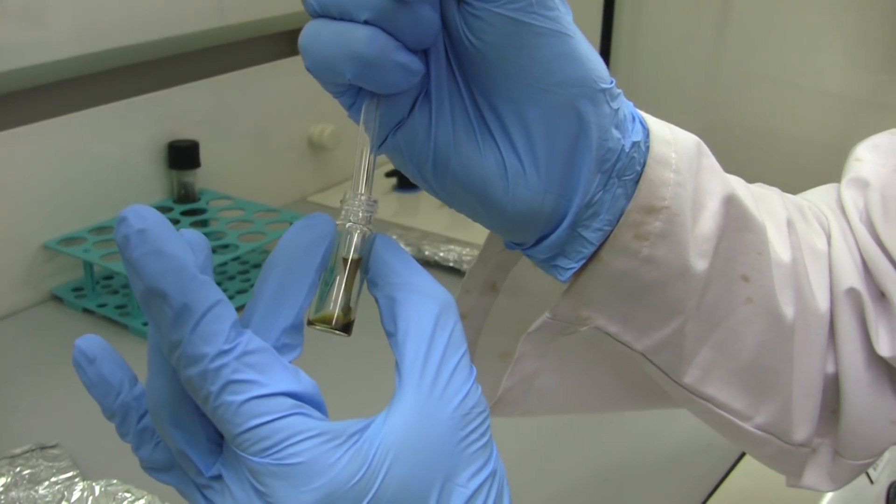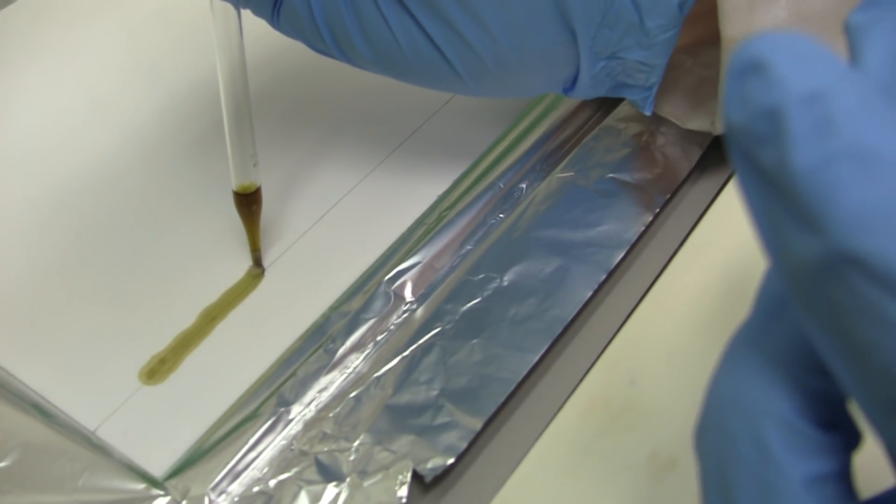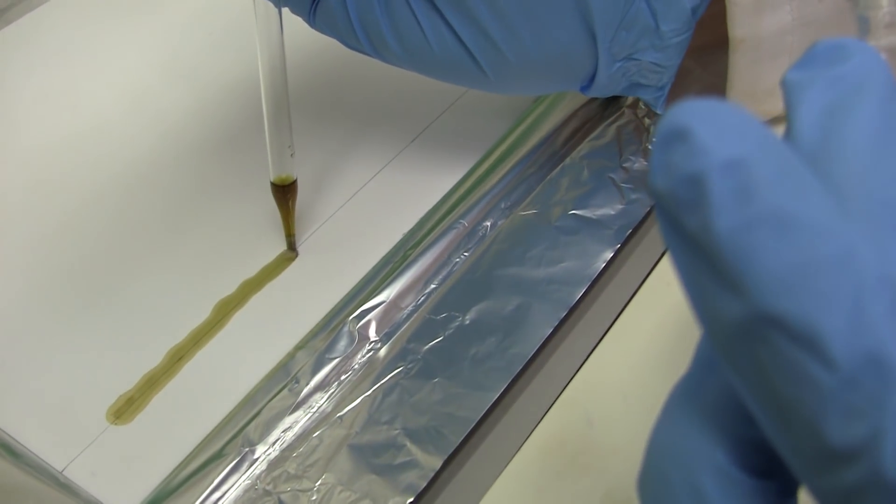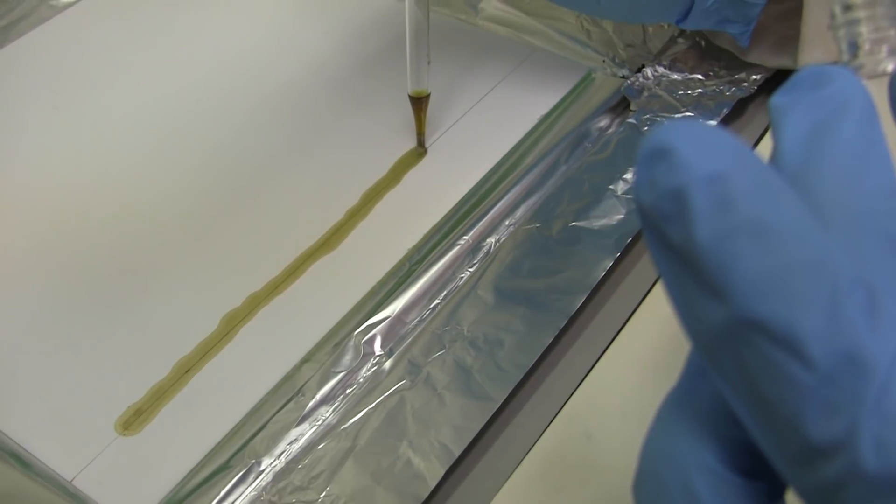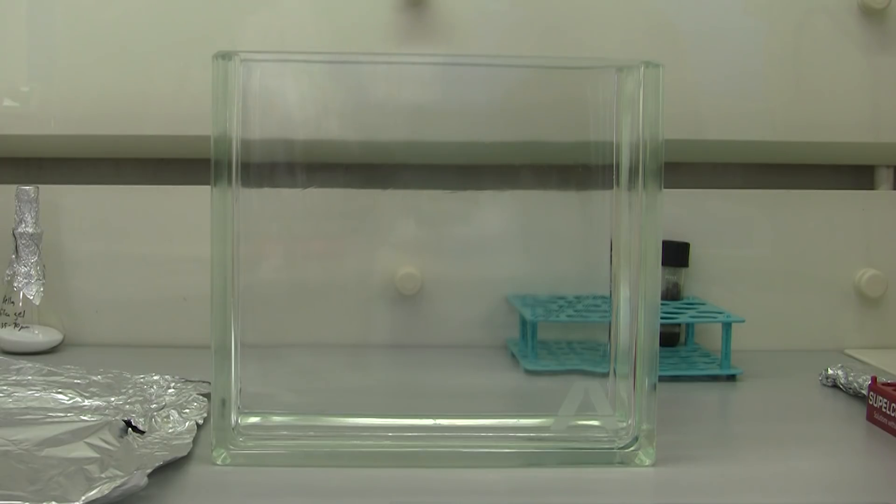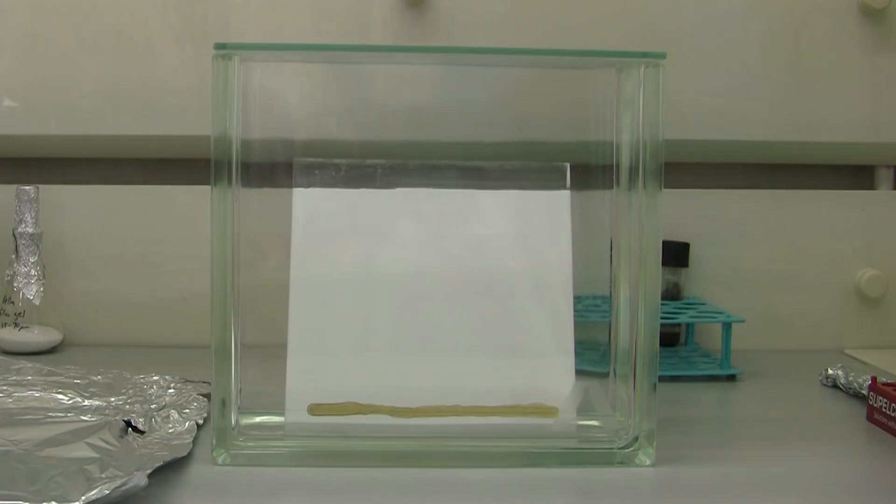For this we can use thin layer chromatography. By putting the pigments on these specific plates we can separate the mix of the pigments into the different components. For this we put drops of our solution on the start line. Then we put it into a specific solvent solution and then you already see the different pigments moving upwards.